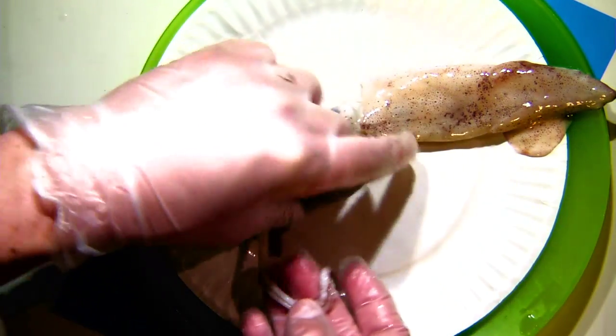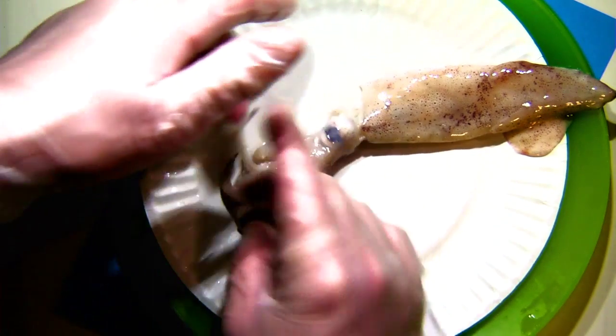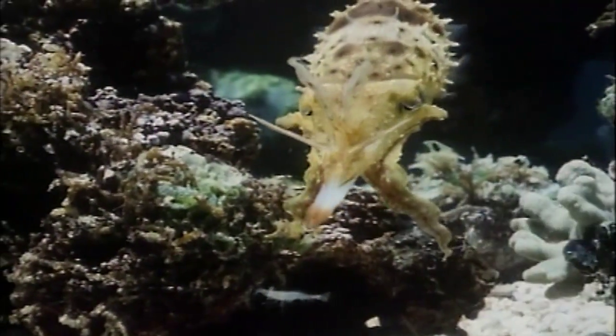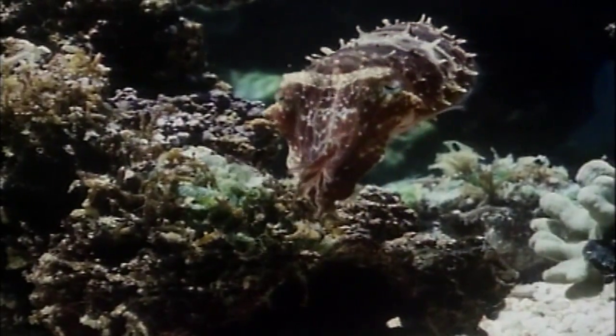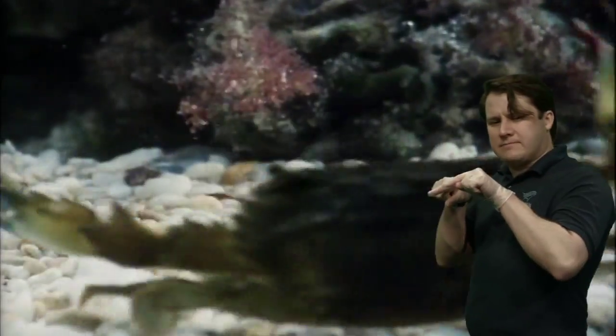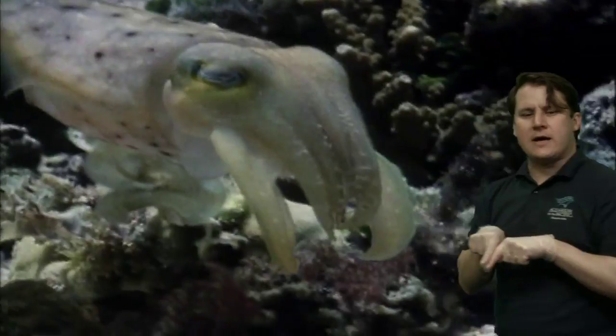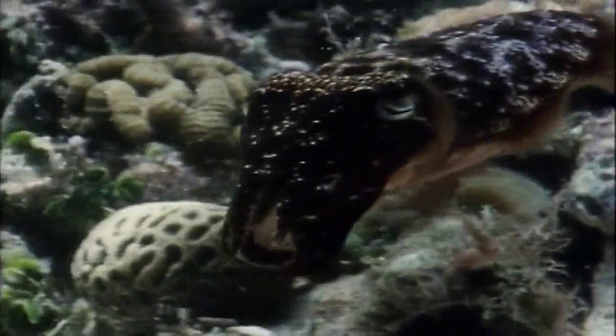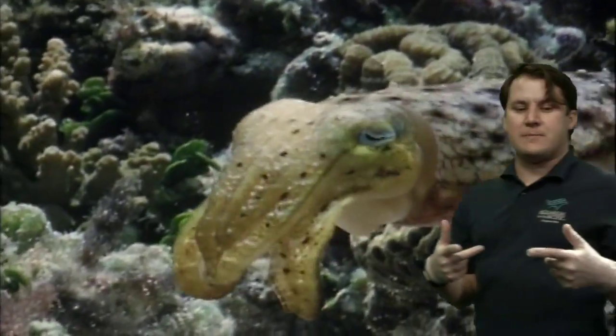The tentacles are more thin, tube-like structures that only have suction cups on a kind of blade at the end of them. These two structures have different purposes, which we can see by watching a video of a cuttlefish eating. The cuttlefish — also with eight arms and two tentacles — sends out those two tentacles almost like spears, darting them out, pulling its food item in, and then grabbing onto it with the arms to manipulate it while eating. The tentacles are for reaching out and grabbing, and the arms are for manipulating and holding once the prey is closer to the mouth.